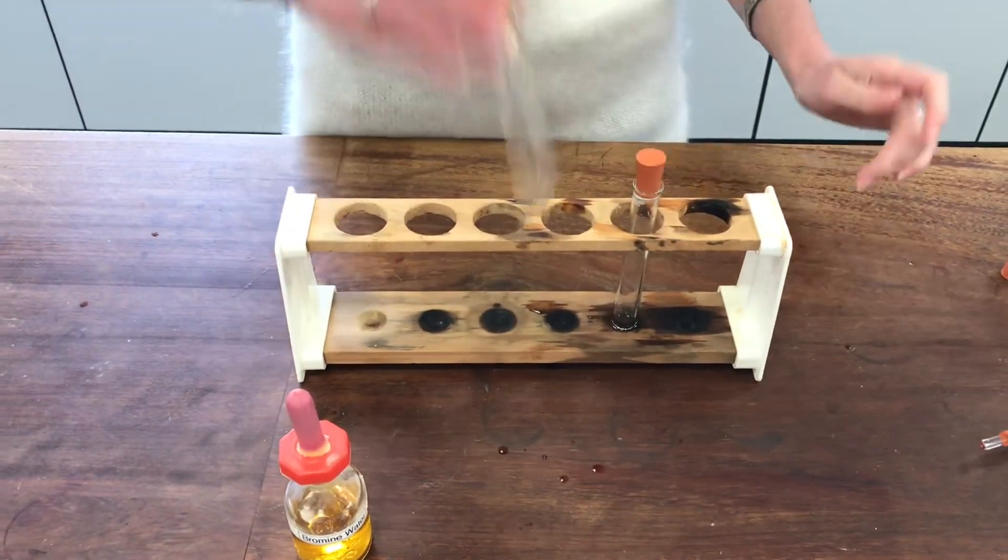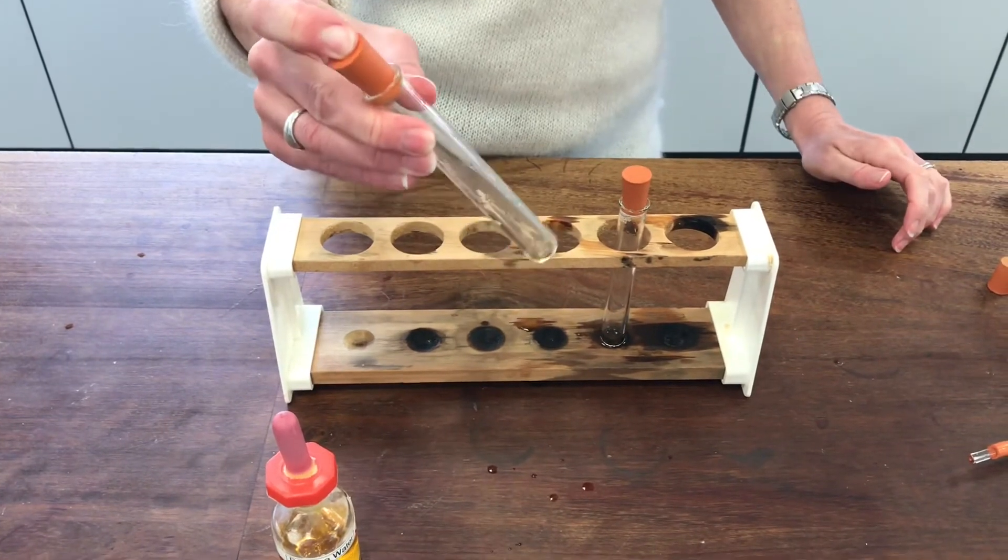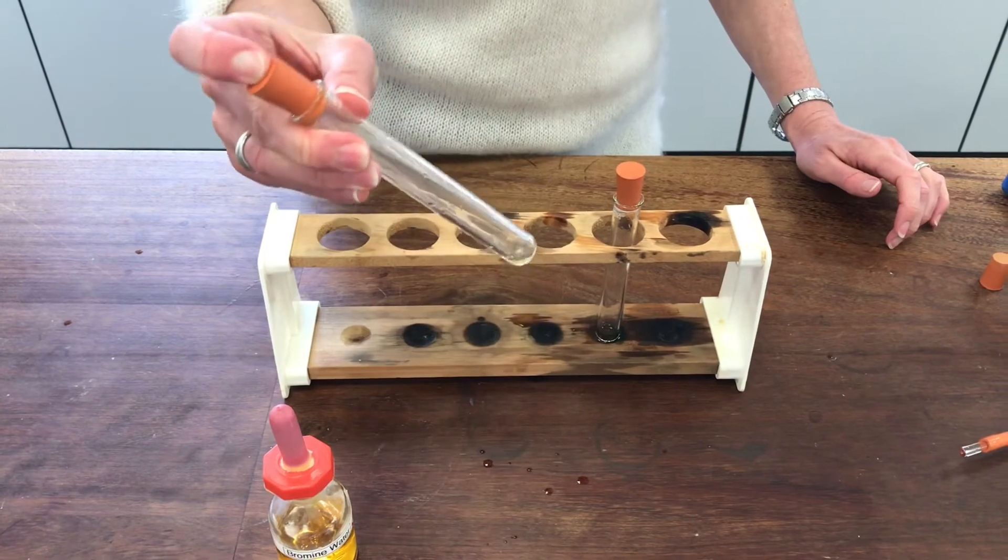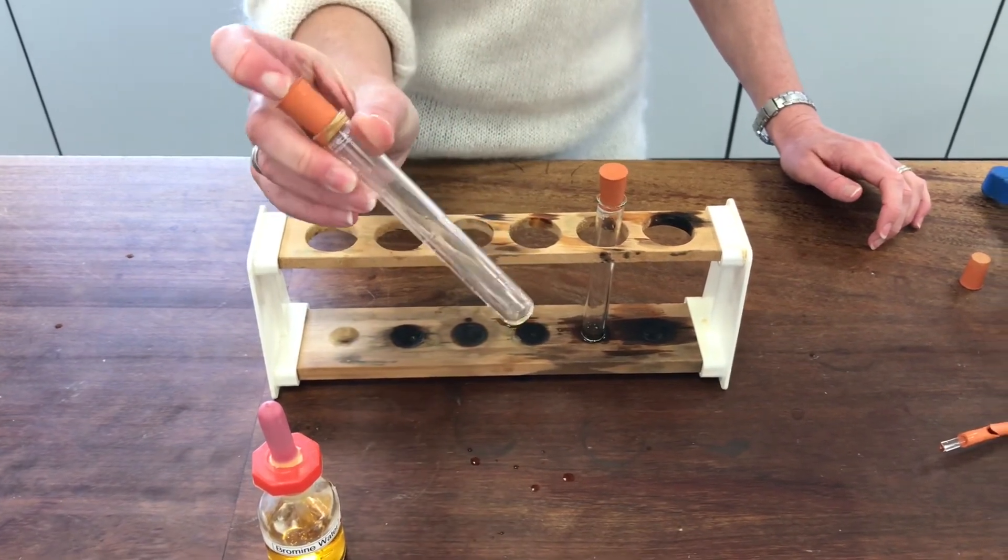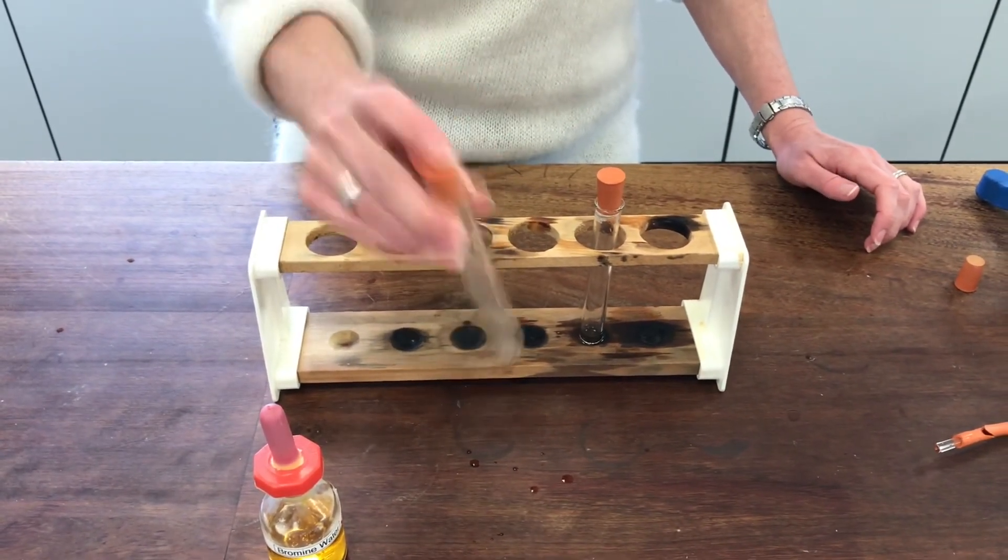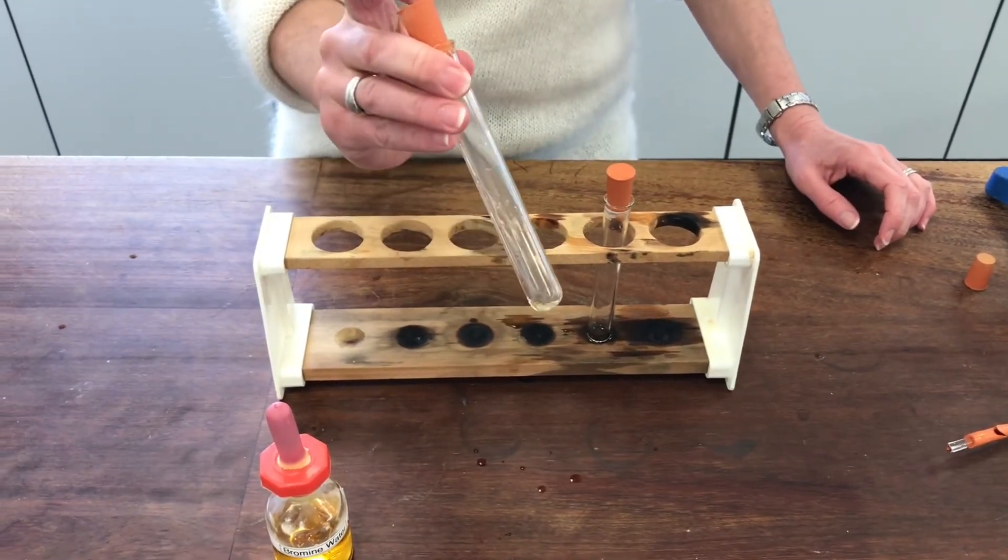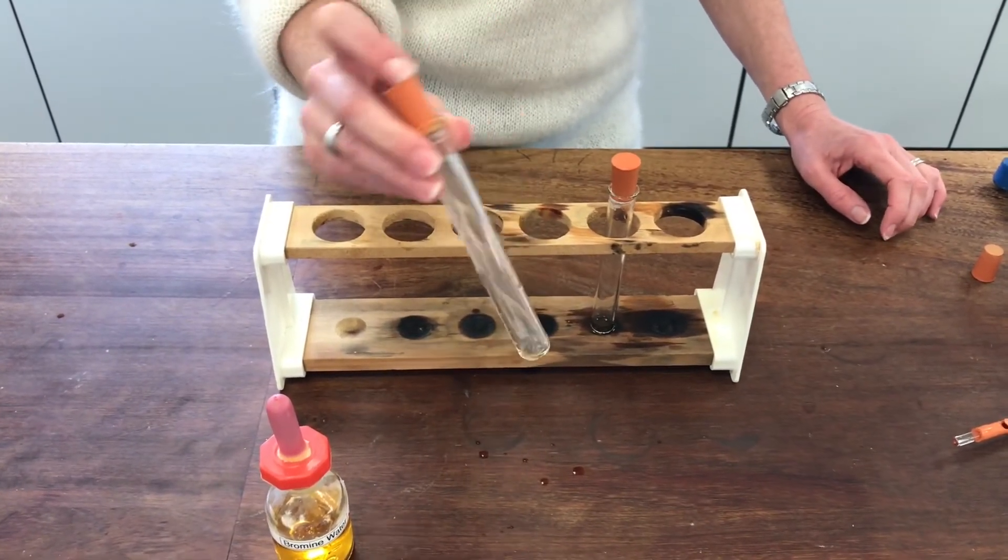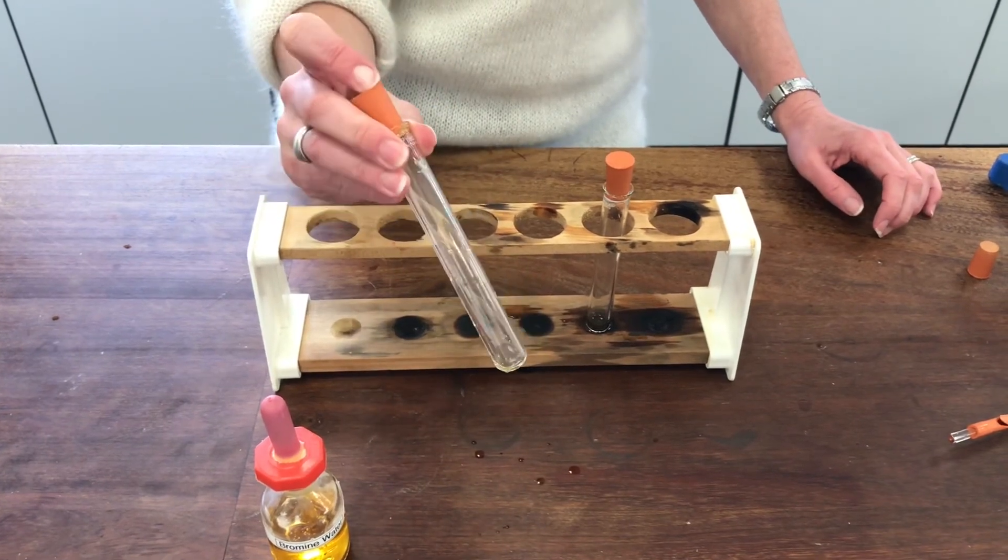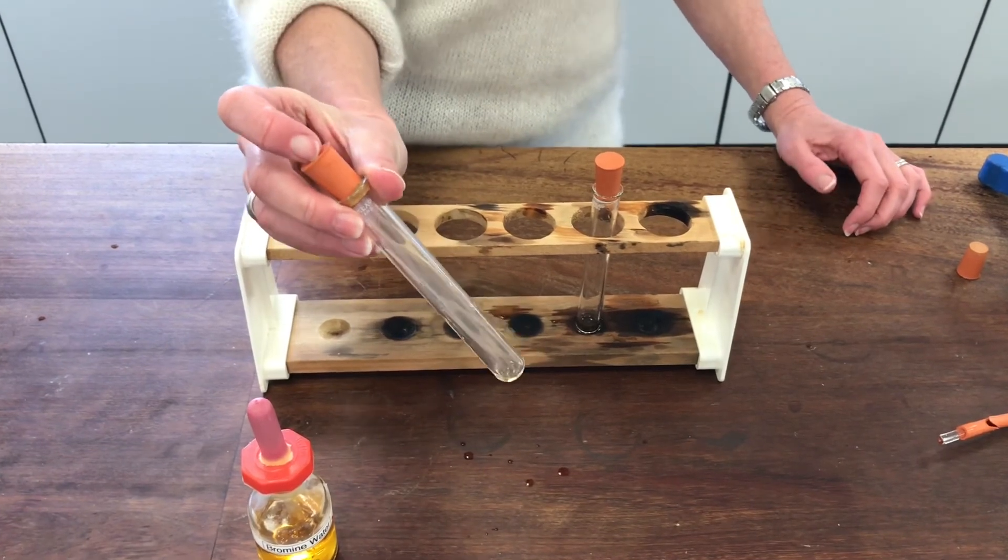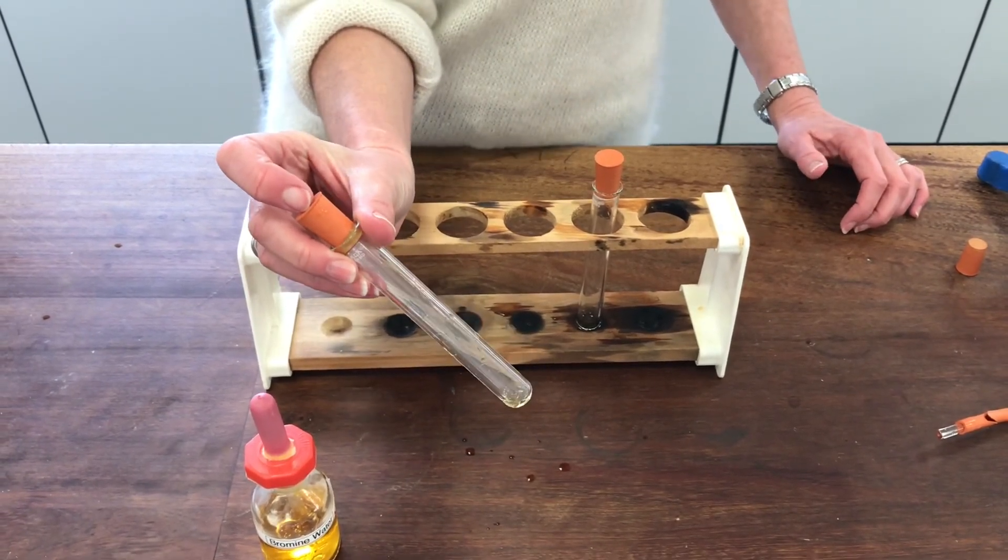Give it a shake up and I think that's quite convincing. There's still a teeny little bit of yellow there, but I was quite heavy-handed with the bromine water. Definitely it's decolorized considerably, so I think that's quite conclusive evidence about what kind of molecule I've collected as a product of this reaction.